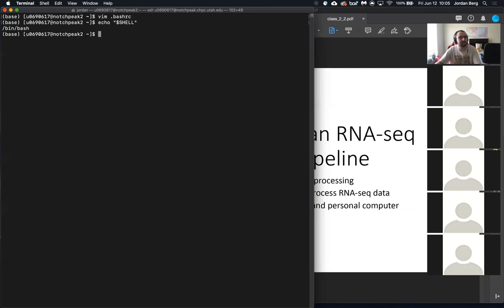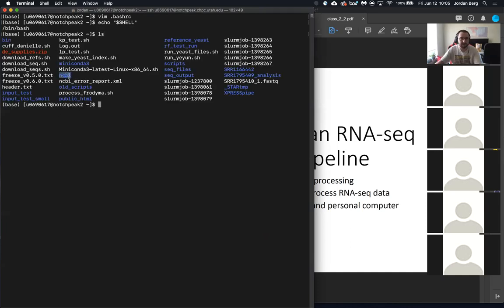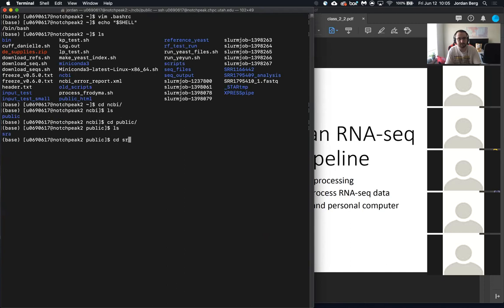Can I ask you a quick question, Jordan? Yeah. I had an issue with the fastq-dump. I got an error saying fastq-dump 2.10.7 error, name not found while resolving query with virtual file system module. Interesting, I have no idea what that means. Did you have an NCBI folder in your home directory created? I had to create one. It wasn't automatically put in. I tried that and it didn't solve the problem.